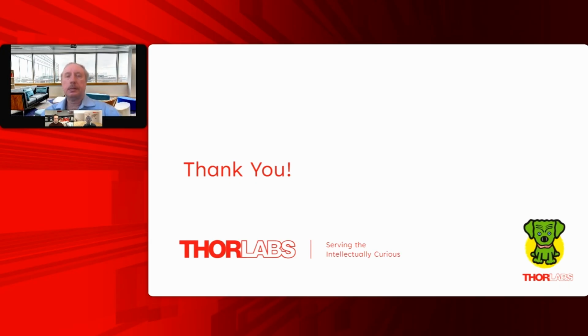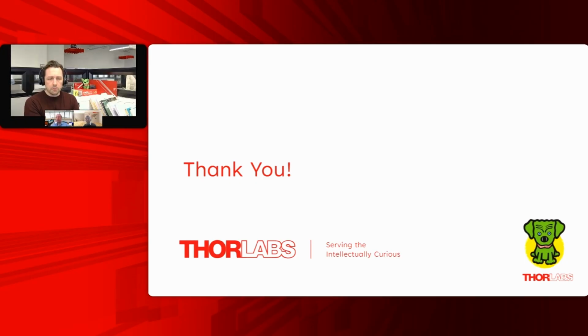Okay. Thank you. Feng, you had mentioned a couple times, in the context of both the semiconductor lasers, the ICLs and QCLs, but also in the supercontinuum, the importance of beam quality. Can you expand a little bit about what you mean by beam quality and how that shows up in these applications? I think you touched on the relative brightness.